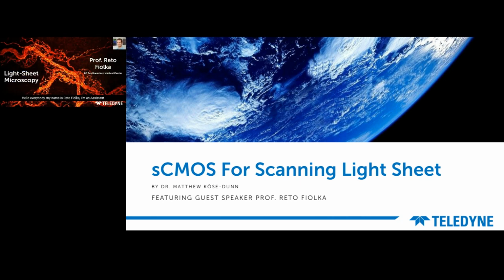Hello, everybody. My name is Reto Fiolka. I'm an assistant professor at UT Southwestern Medical Center in Dallas, Texas. And our work has been focusing on light sheet microscopy for the last roughly 10 years. And we also, of course, make use of advanced scientific cameras. So I can just talk a little bit about some basics of light sheet microscopy and where also camera technology comes in.